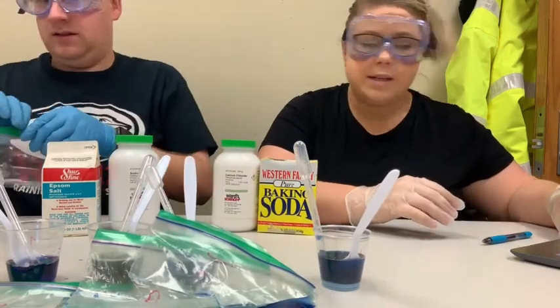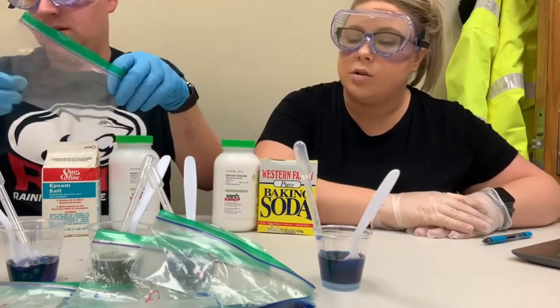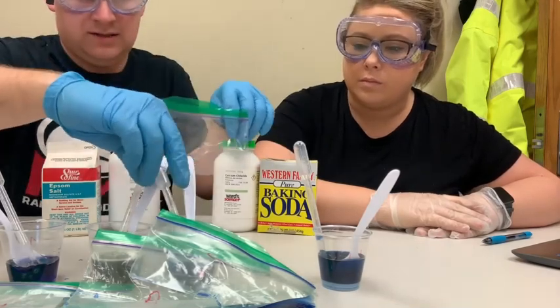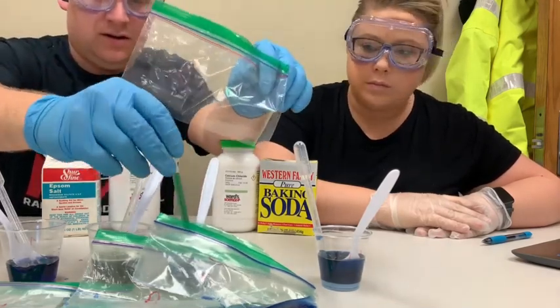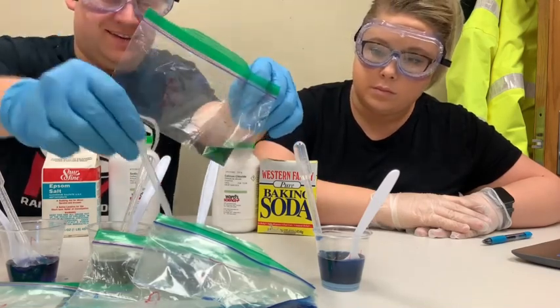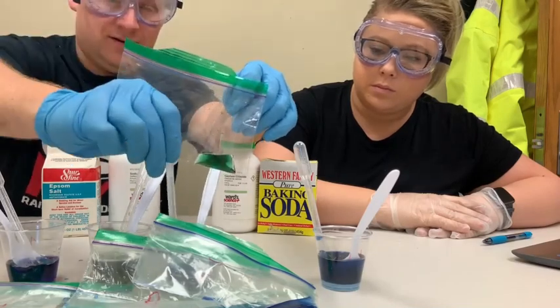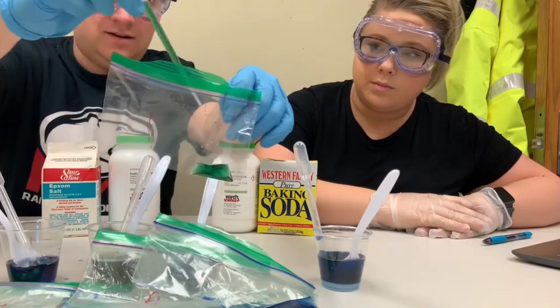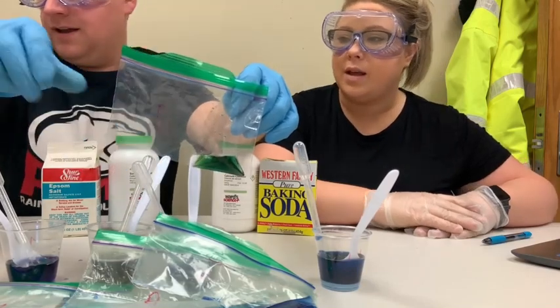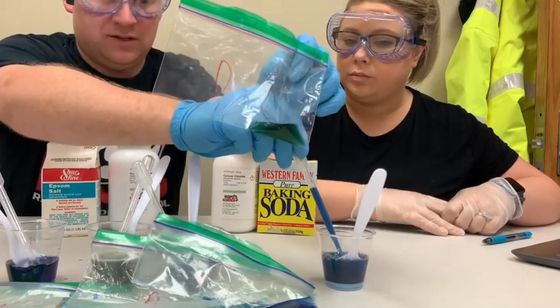All right, and in bag D, we're going to mix calcium chloride and sodium bicarbonate. So 3 pipettes of each, calcium chloride and sodium bicarbonate. So calcium chloride, that's this one right here. Okay, and sodium bicarbonate. So I'm going to try to grab more from the solution this time.